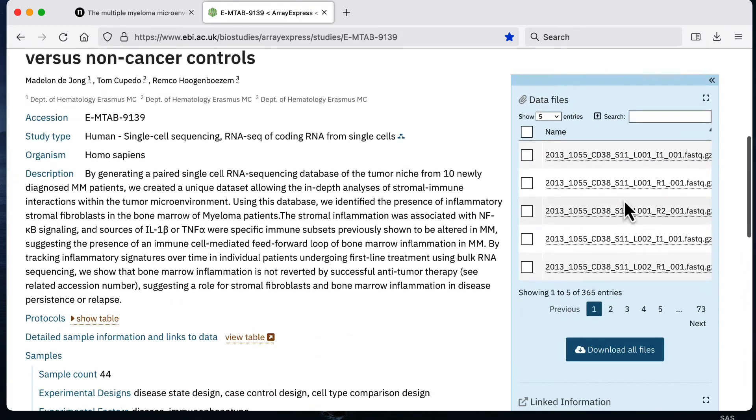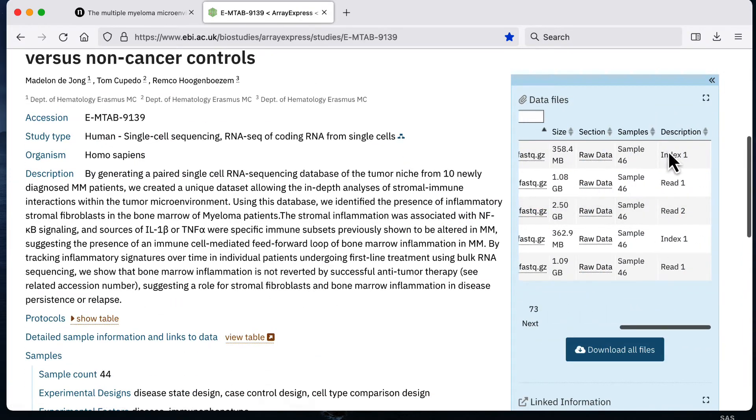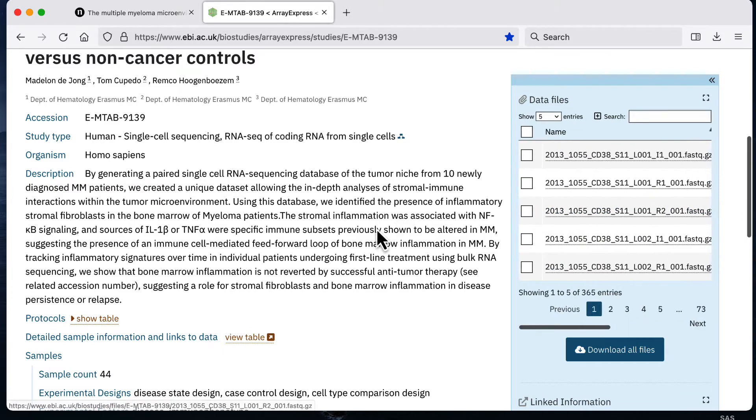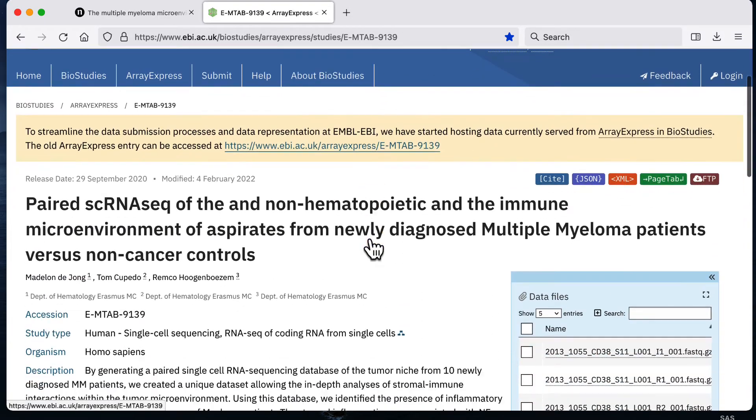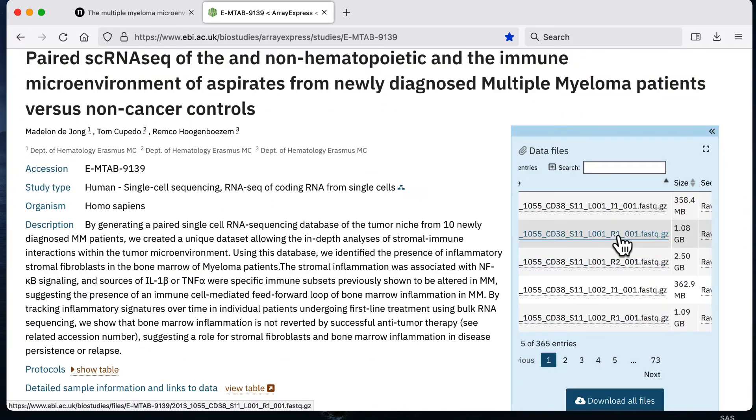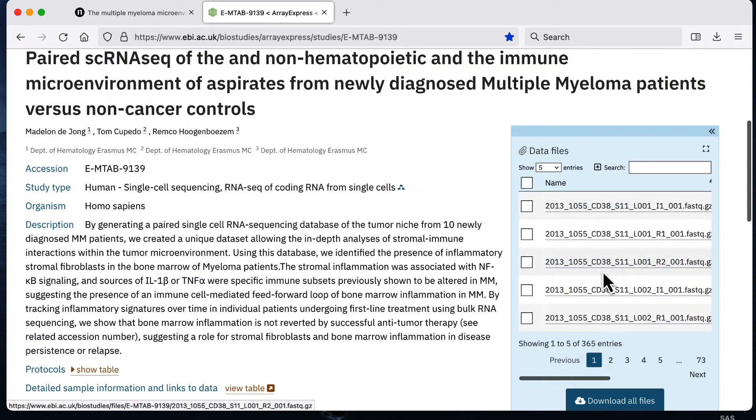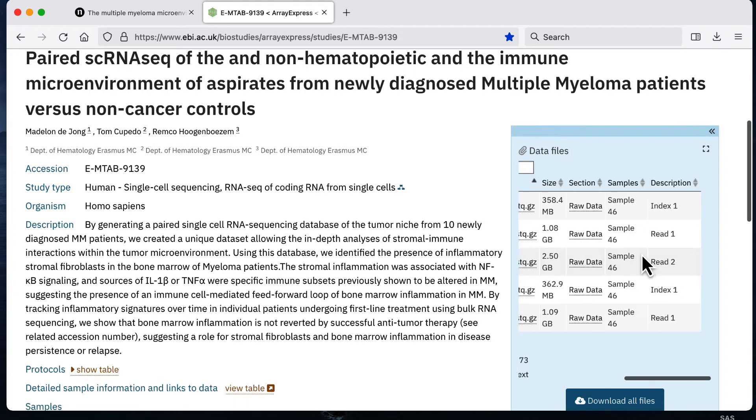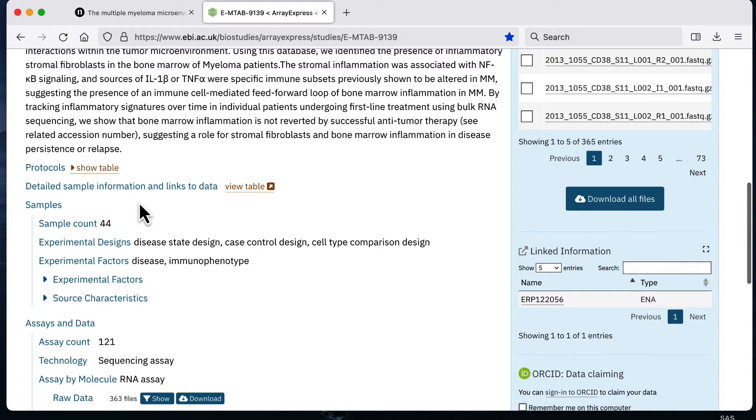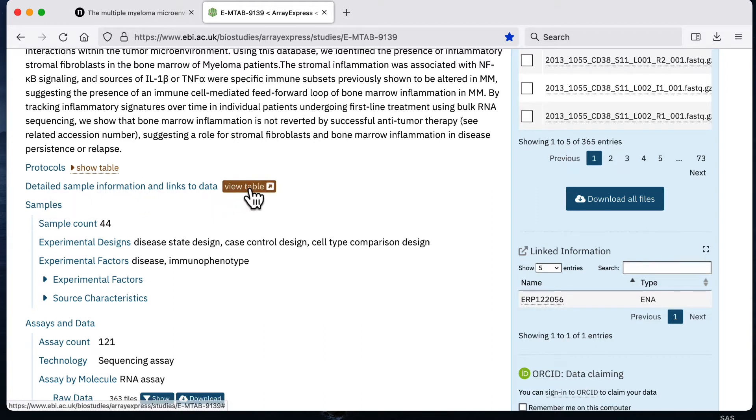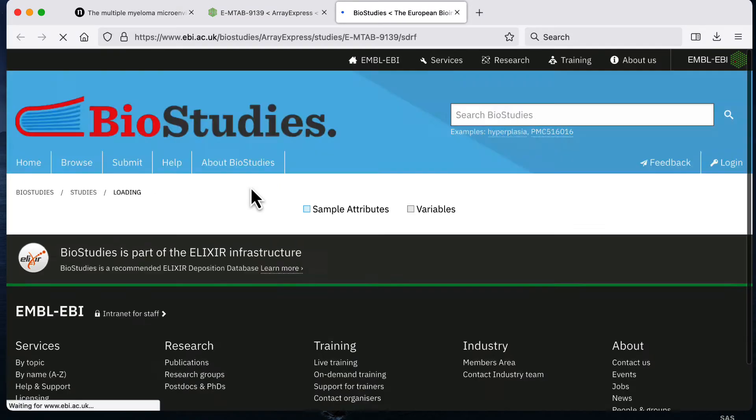It has the data on the right hand side in this blue box, but for me when I want to download the data I want to know the detailed information about where each of these files are coming from. I'm actually going to download the data from this section here which says detailed sample information and links to the data. I'm going to click view table here.